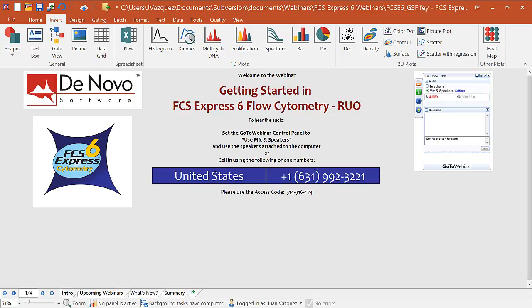I'm extremely honored to provide you this opportunity to show you a basic introduction to FCS Express. We just recently released FCS Express 6, so I will try to show you a basic overview of the basic functions of FCS Express 6, but also try to show you some of the new features that are now available to FCS Express. I won't be able to go into too much detail about some of these new features. We will have several upcoming webinars that focus on all of these new features and go into much more detail, but I will try to provide a high-level overview of how you can add these different objects, these different features into your analysis and make it produce results for your data.